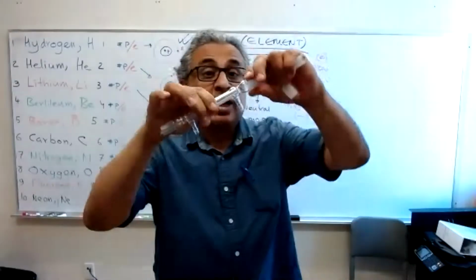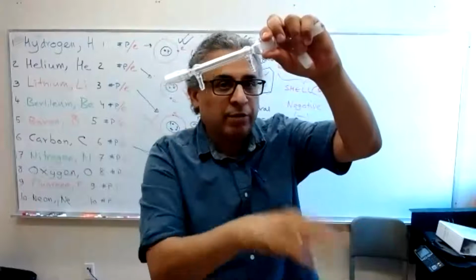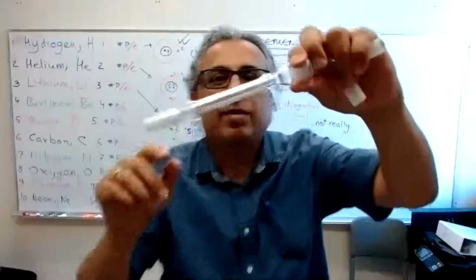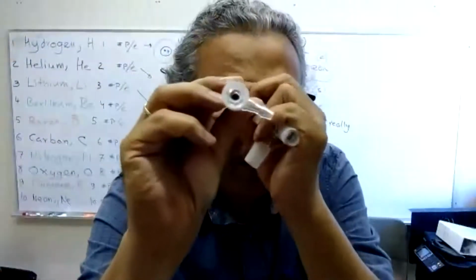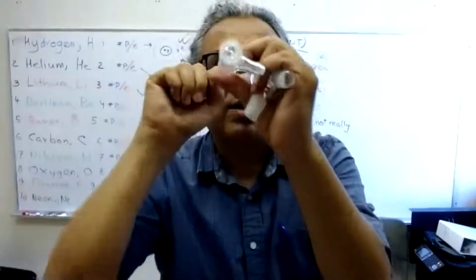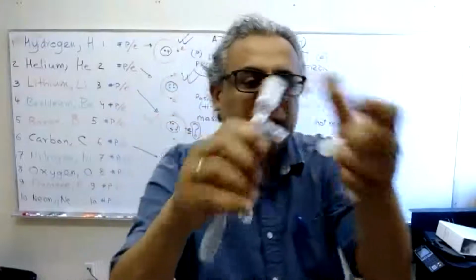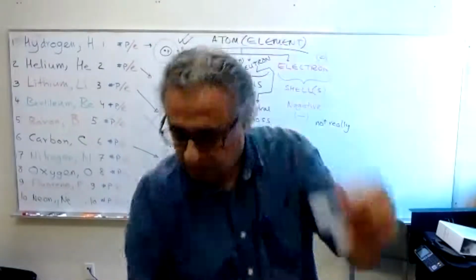This is a condenser because what can you do from here and here? You can unmute, everyone unmute. Talk, let's talk. Water into it. Water in and water out. And you can see that when I look through it, there is this passage. This is where the material passes, the steam or the gas that comes up from the flask.